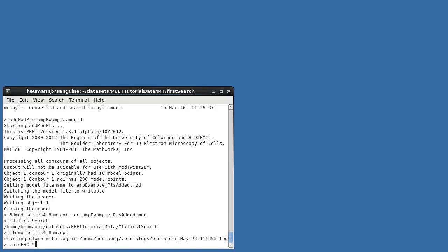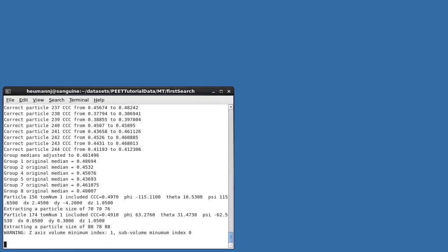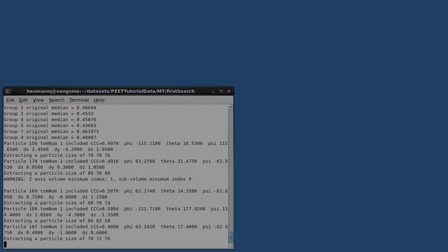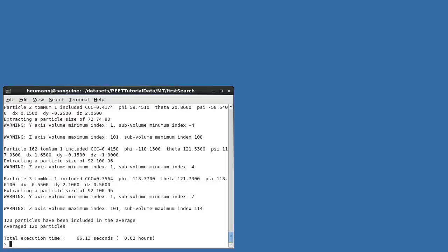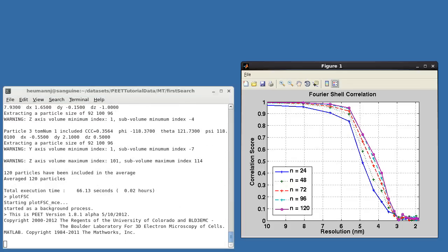As before, we can run CalcFSC and then PlotFSC to get an estimate of the resolution achieved, and you'll see that we have a resolution of approximately 4.2 nanometers at the 50% response point.